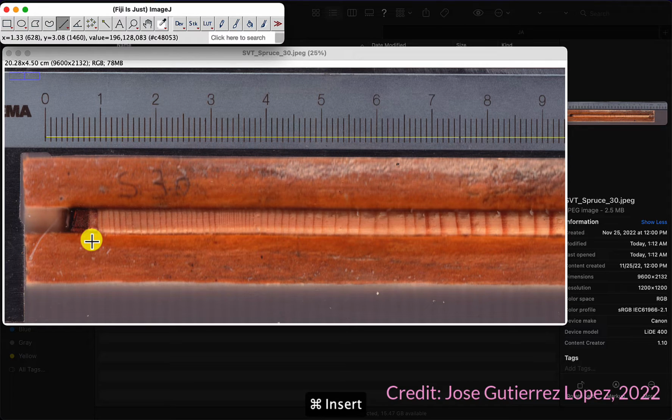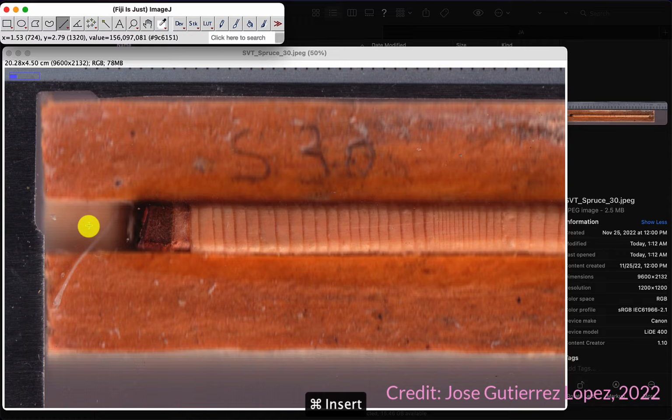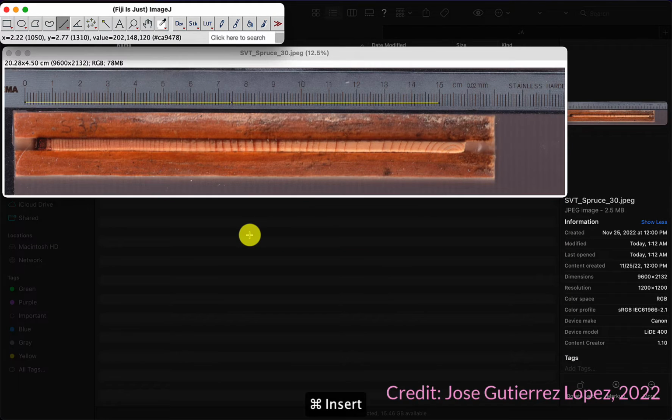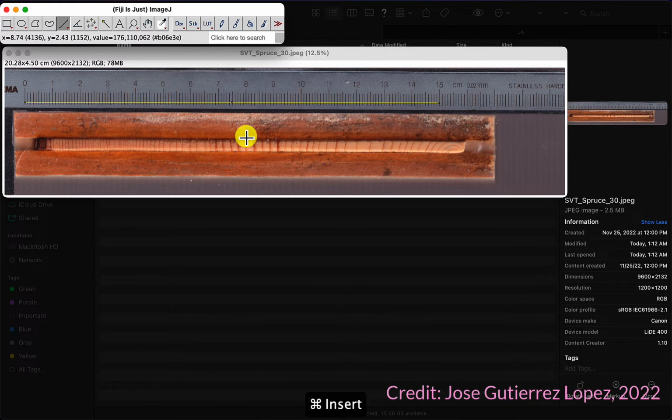Once the scale is set, I'm only going to zoom in here where I should start. To zoom in on a specific region on my computer, I press Ctrl and then zoom in with the trackpad. But I'm sure that every computer might be different.